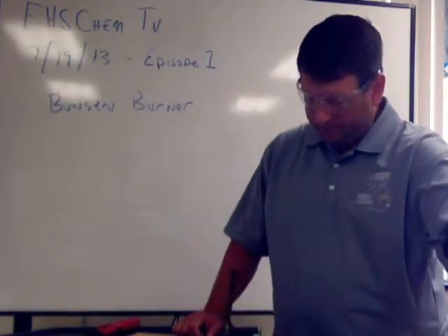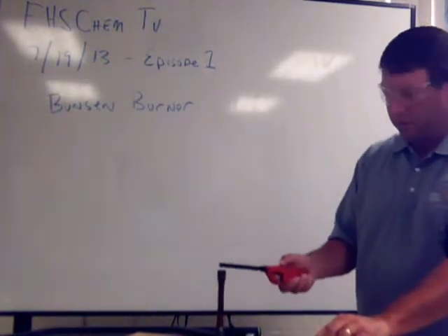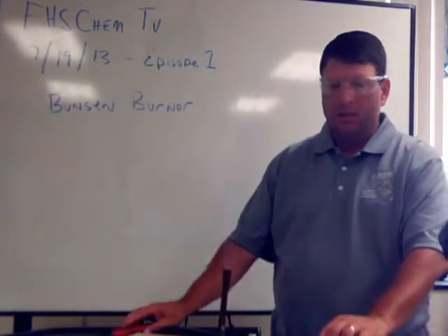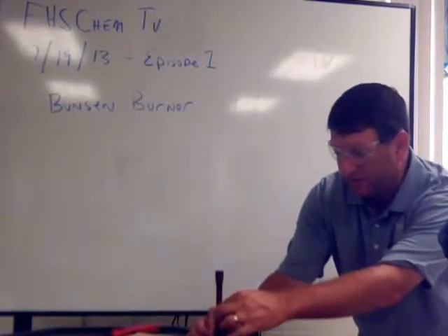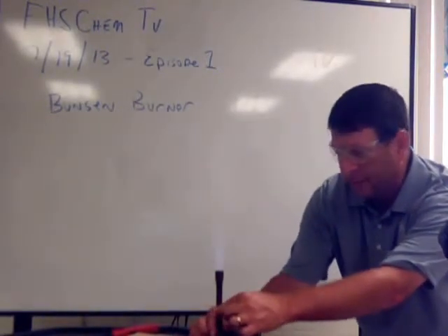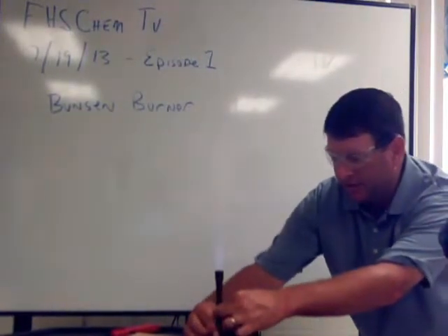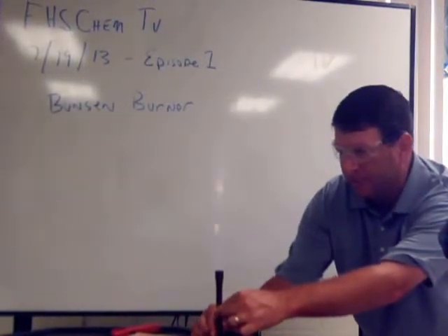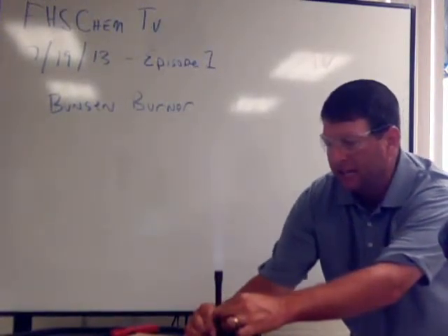Over here, off screen, is the valve. I will turn the valve on, then come over and light the Bunsen burner. Through the use of the air intake valve, I will adjust the flame. As you can hear and see, adjusting the air intake valve adjusts the flame.